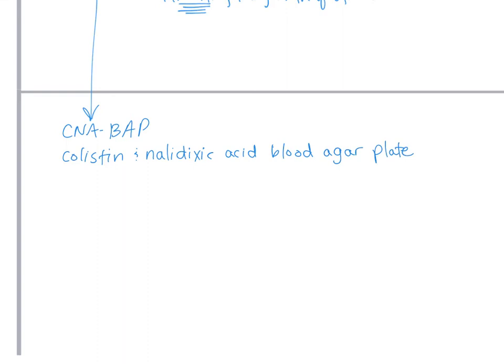Okay, and when you see these in lab, you are going to understand right away, yes, there is blood in this agar. It has sheep's blood in it. Okay, so that's a really rich medium. Lots of organisms grow really fast, really well on blood agar plates.